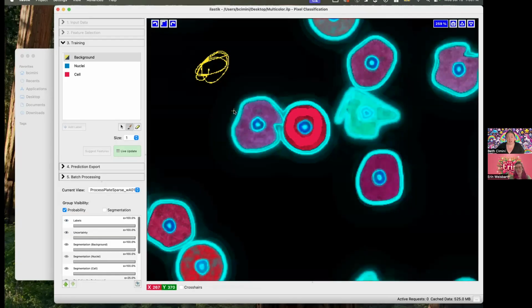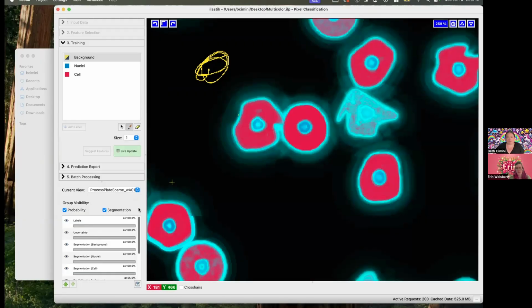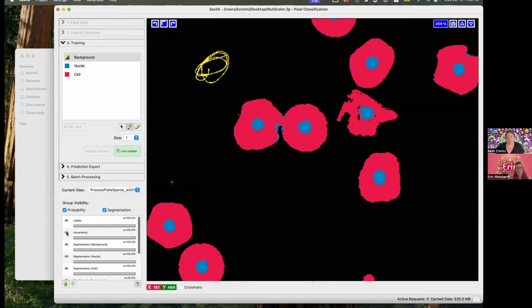The things aren't going to change much, because I've made this uncertainty even less, but I haven't actually fixed my segmentation problem at all. But if I go to where the uncertainty is high, then I can fix my segmentation much more easily with many fewer pixels. And fewer pixels is always better, as we'll talk about in a future episode.